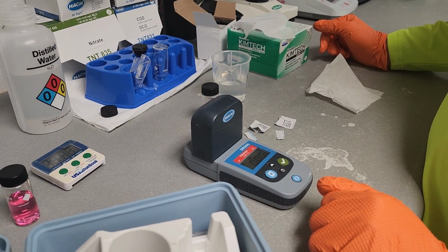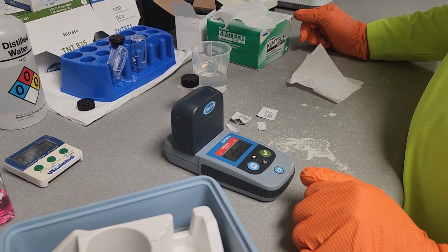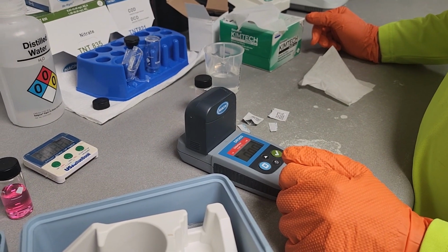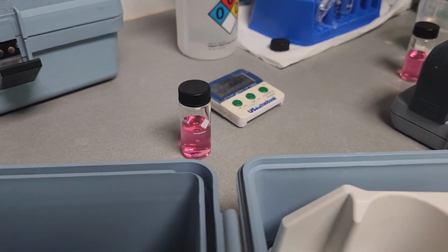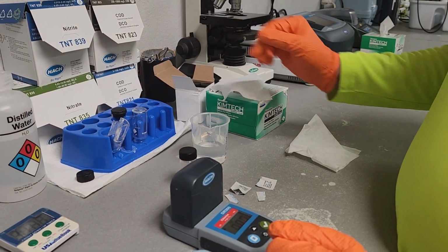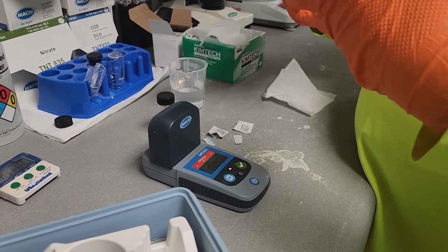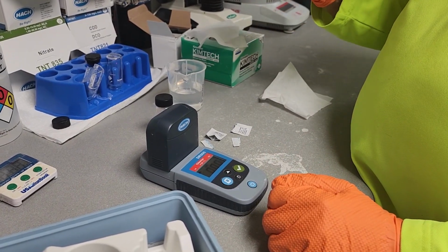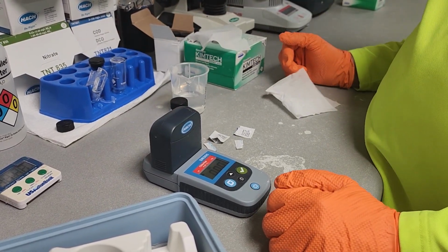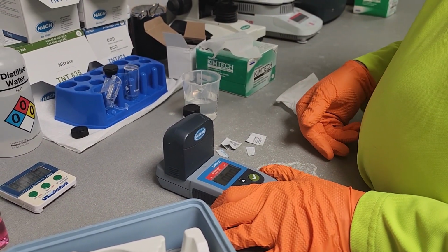A 1.11 residual is pretty good. It's below the 4.0 MCL for free chlorine, the maximum contaminant level. So in our system, we should have combined residual as well. Now in our system, we draw from groundwater, but that doesn't mean there can't be a little bit of something organic in there that chlorine is combining with. It's probably going to be really close. I would expect that we're not going to have much in the way of combined residual, but we'll see.